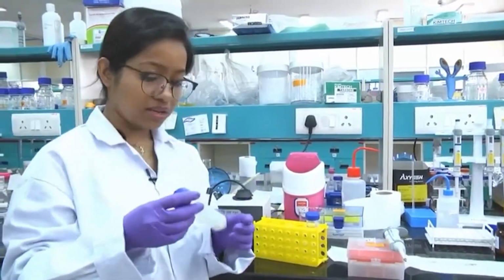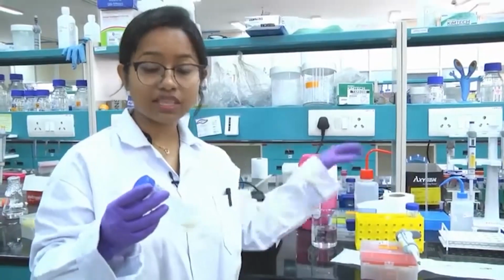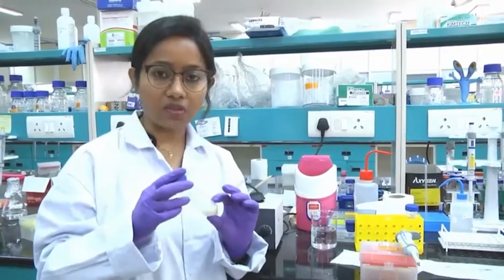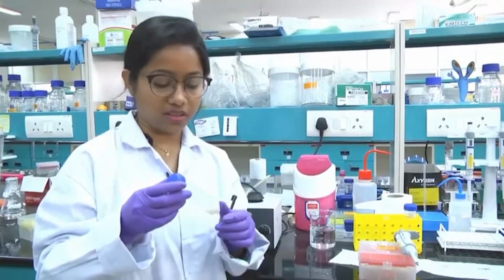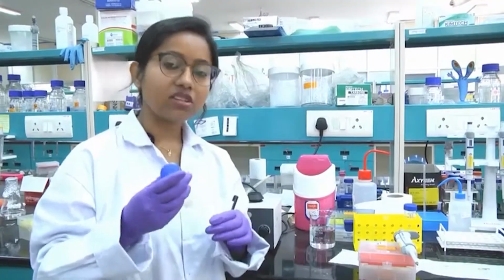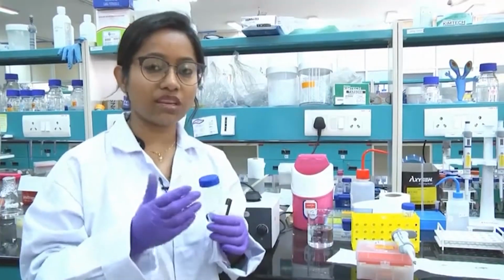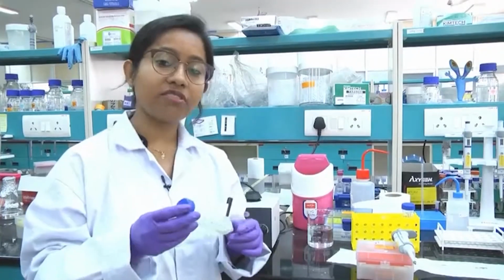When you dissolve this in a lysis buffer, if you are doing it on a previous day, you can keep it dissolved and store it at -20 or -80 degrees centigrade so that it freezes. The next day you thaw it, and then you start the purification. So there is a freeze-thaw cycle once. That also helps in lysing the cells, because the proteins are inside the cell. You need to break down the cells so that the protein comes out into the solution. One freeze-thaw cycle is good.